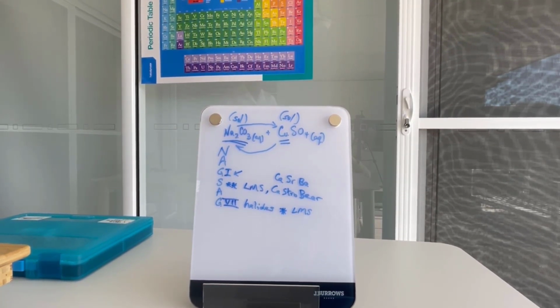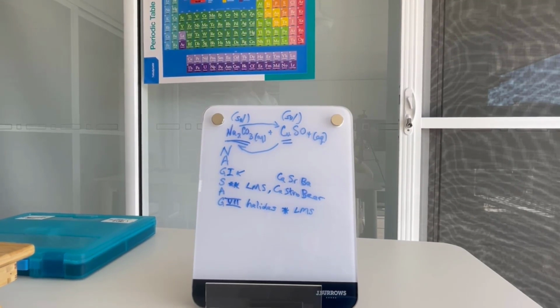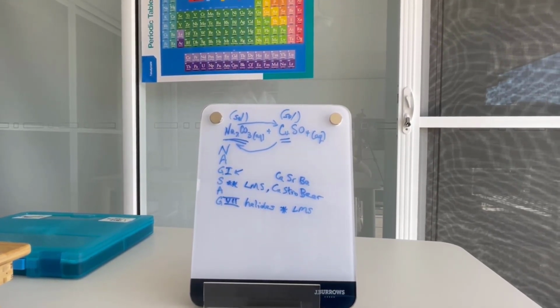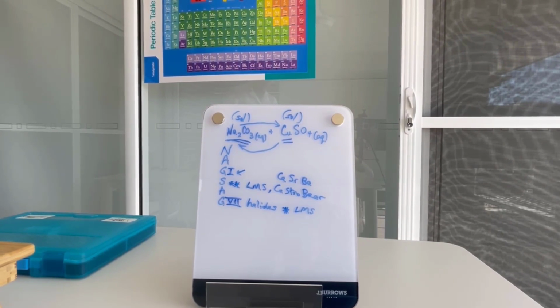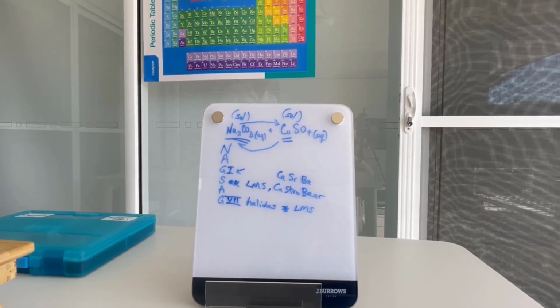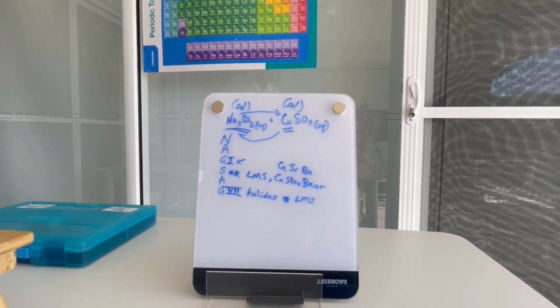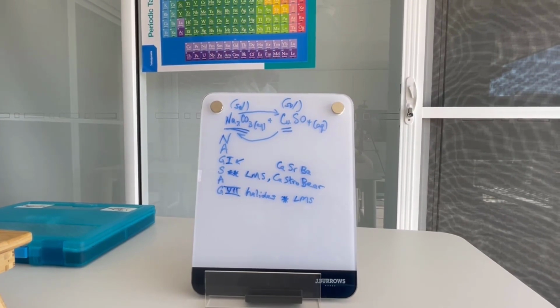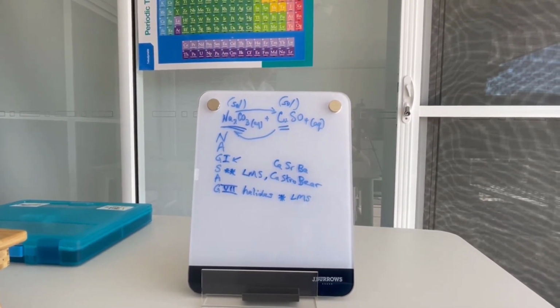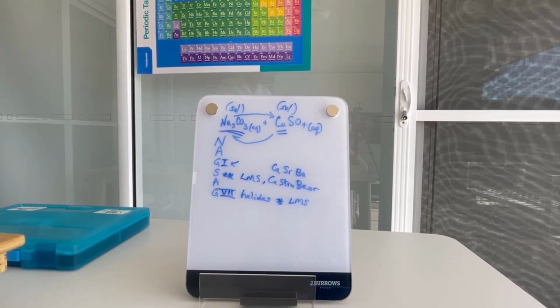Now the thing is, all of these ions are in solution. So you can also think of it as all species are available, two lots of cations and two lots of anions, and then they shuffle themselves out into whichever of those is the least soluble in water. Now, for the reasons that we already discussed, sodium with anything is going to be soluble. So anything we see is likely not to be sodium. But what about the copper and the carbonate? Copper doesn't fulfill any of the NAG-SAG requirements, but neither does the carbonate. So let's see what happens.